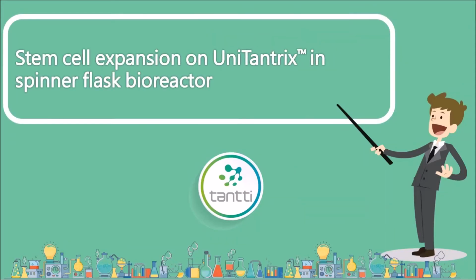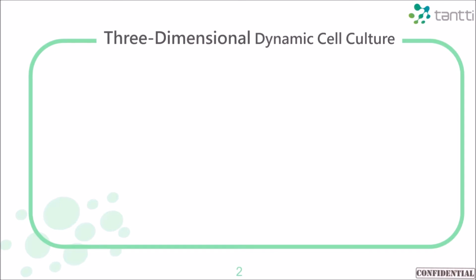Stem cell expansion on UniTantrix in spinner flask bioreactor. Why do we use three-dimensional dynamic culture to amplify stem cells?